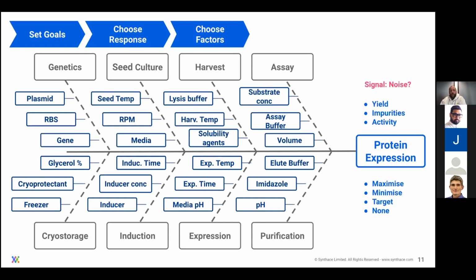And so here is our protein expression example diagram. I love these diagrams as a tool to really make you think about your research. It also amazes me how they capture the complexity of what you're trying to achieve. Ishikawa diagrams in combination with DOE provide a framework to systematically think about your research and experiment on complex biological systems.